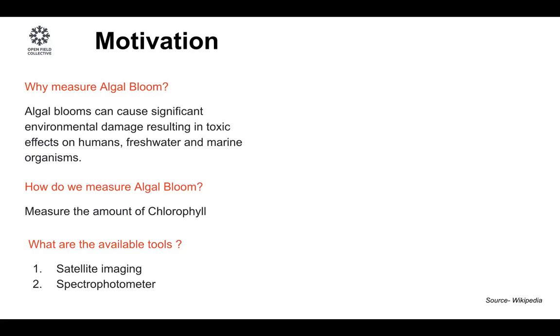Now, algae can be red as well, but most of the algae are green in color, which has chlorophyll. But the spectroscope machine that we will provide you, and we are teaching you how to develop and do experiments with, can in principle identify different kinds of algae as well, because it's just light.